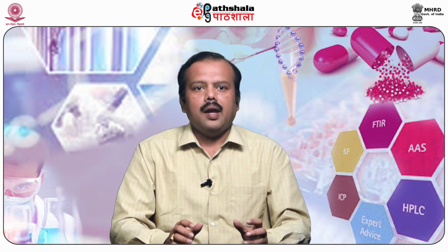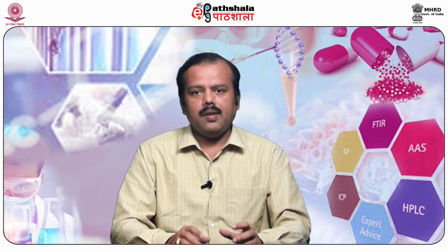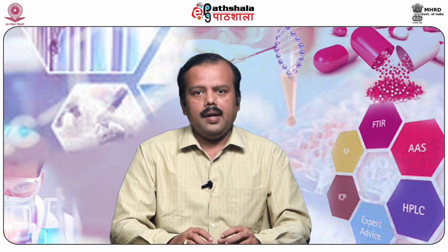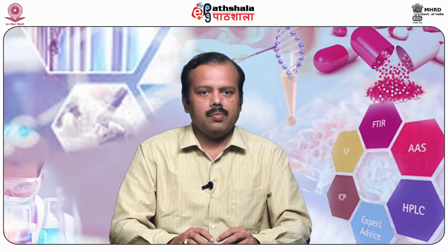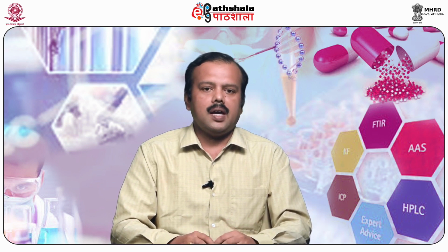Minor modification of the individual ingredient may be made, or reconstituted dehydrated media may be used, provided the resulting media have equal or better growth promoting properties and give a similar standard curve response. Dissolve the ingredients in sufficient water to produce 1 liter and add sufficient 1 molar sodium hydroxide or 1 molar hydrochloric acid as required, so that after sterilization the pH of the media will remain between 6.5 to 8.0. The liquid media or solid media are prepared in culture tubes or in petri dishes as per the assay design.